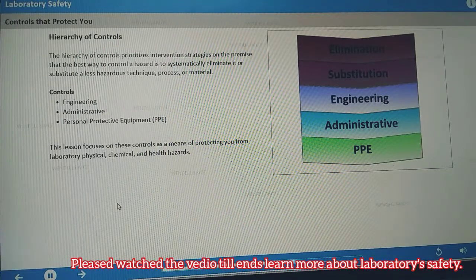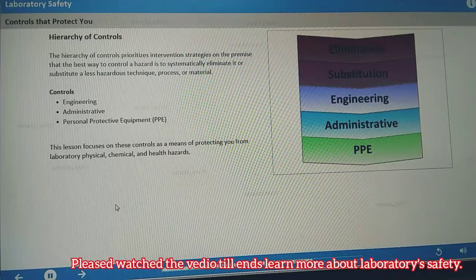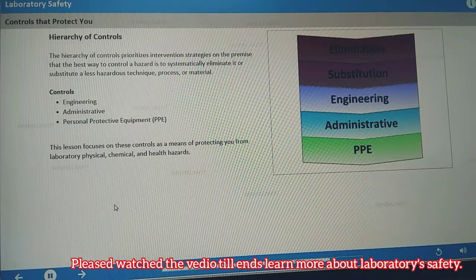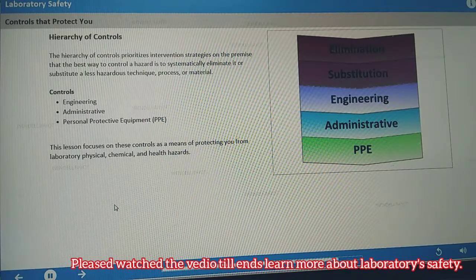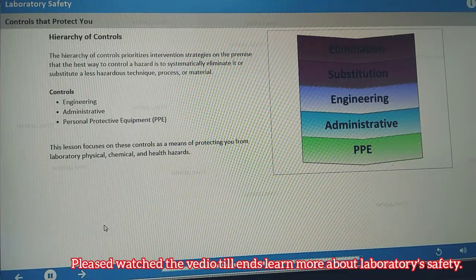Your responsibility is to use engineering controls, follow administrative controls, and wear personal protective equipment correctly and effectively. This lesson focuses on these controls as a means of protecting you from laboratory physical, chemical, and health hazards.